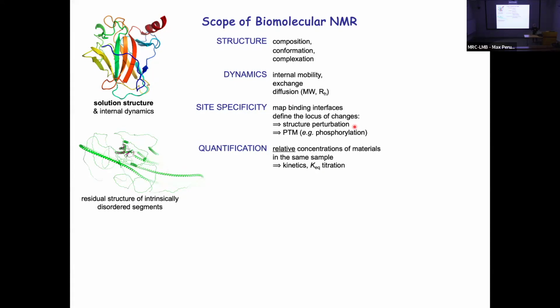The other alternative we have at the moment that's just come in the last couple of years is AlphaFold, where you use AlphaFold to rapidly generate some candidate structures, and then you use NMR to validate and sort of sift through any alternatives. And if there are multiple conformational states, then you can use NMR data to bias the structure towards a particular conformational state.